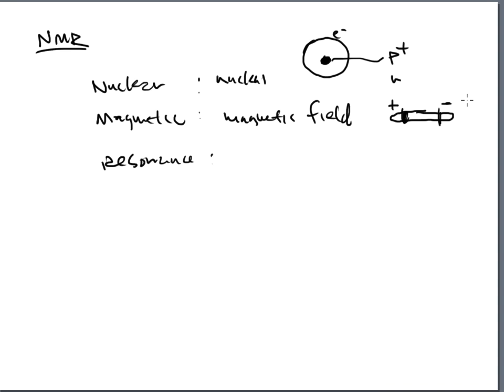The purpose of the magnetic field is to induce a charge, in a way, on these molecules and have them all behave the same way and put some order to the chaos that's getting ready to happen. So magnetic fields are very important, and this is why the word magnetic goes into NMR.